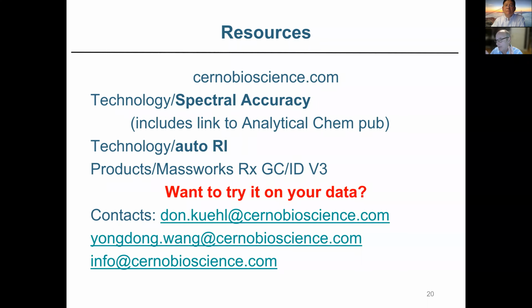You won't get accurate mass, but you'll still get retention index and the other deconvolution, which in my mind is probably 80% of the power. It's quite powerful. So it would not impact your workflow at all. It can be run in parallel. It can be run on every sample, or it can be run just on samples that are problematic.